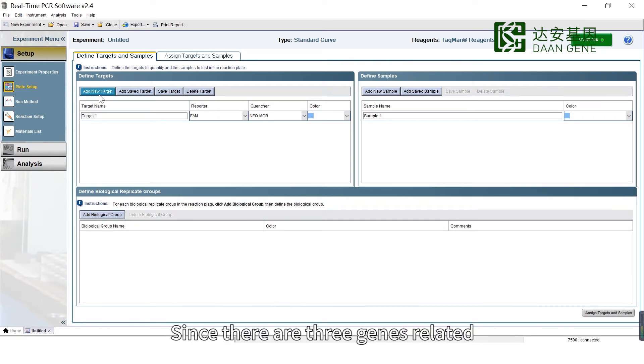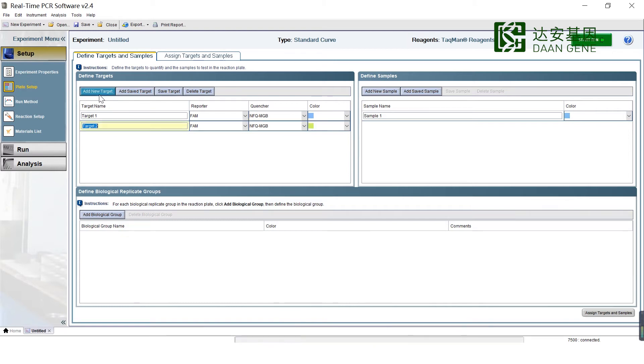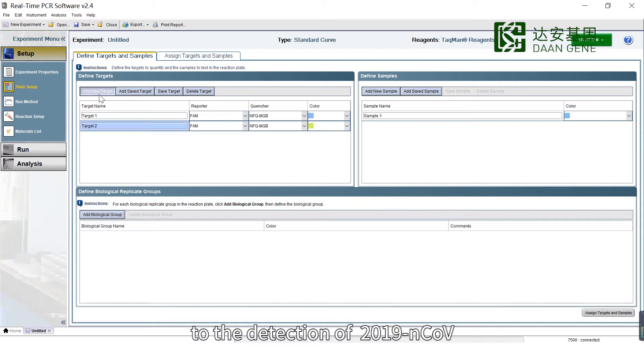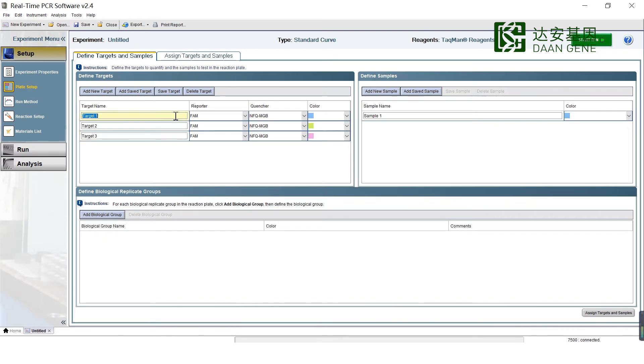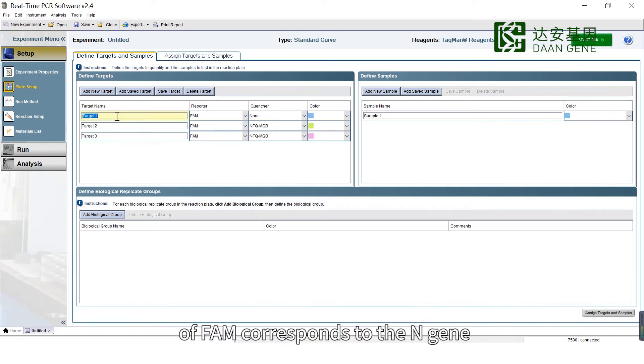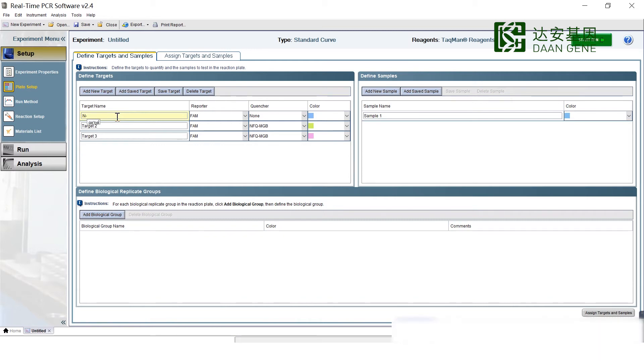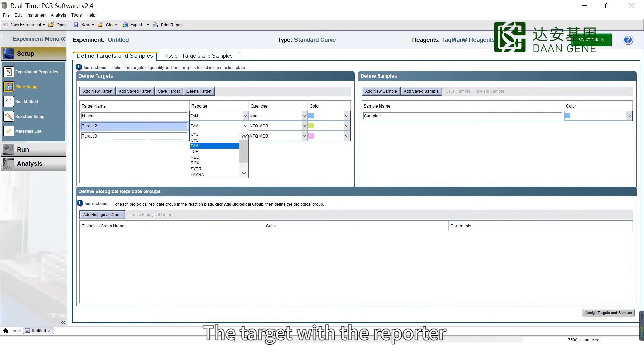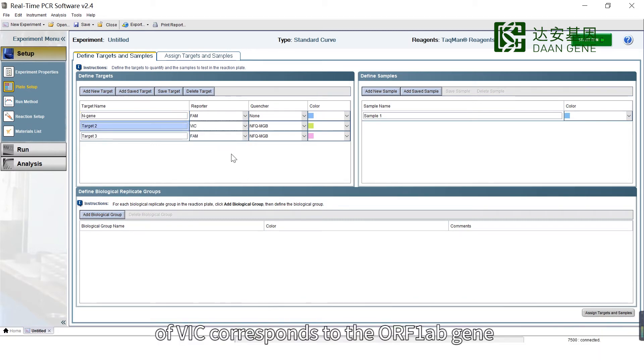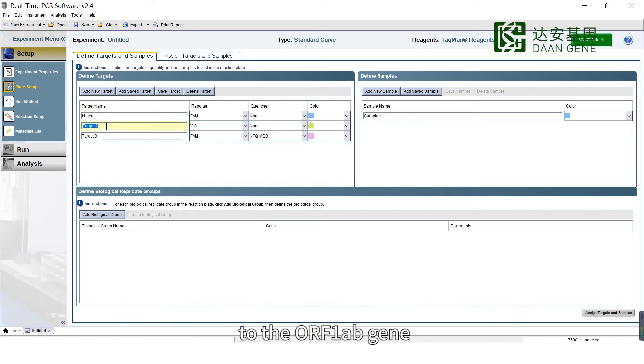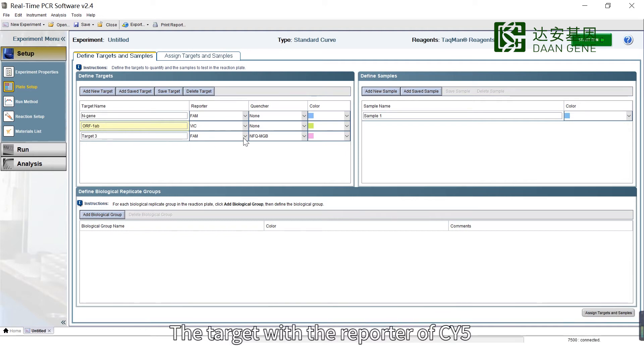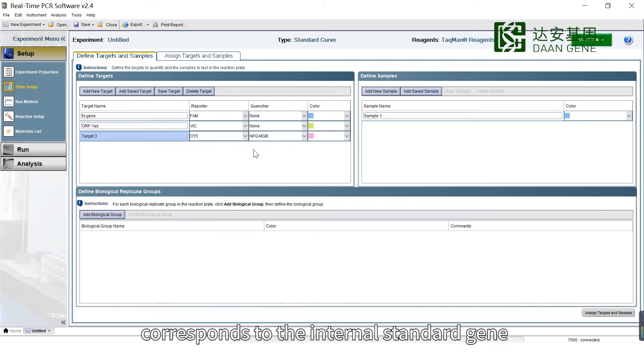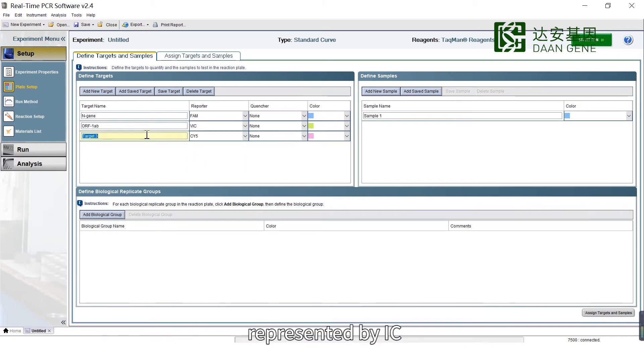Since there are three genes related to the detection of 2019 Novel Coronavirus, add the following three target genes. The target with reporter FAM corresponds to the N gene. The target with reporter VIC corresponds to the ORF1AB gene. The target with reporter CY5 corresponds to the internal standard gene represented by IC.